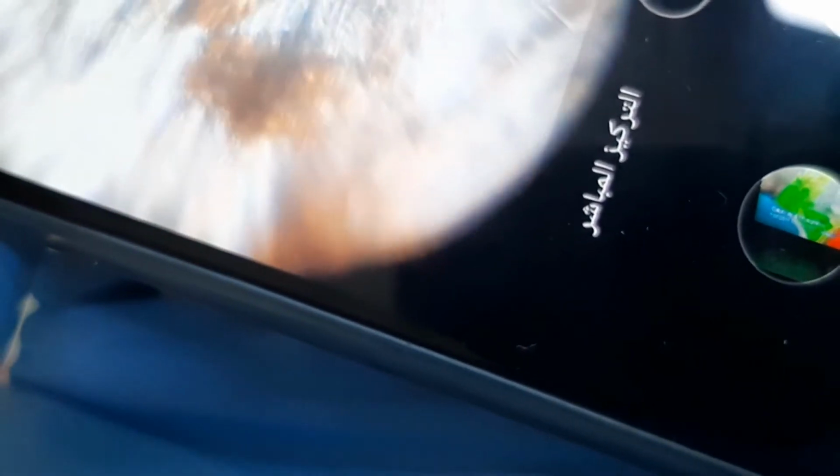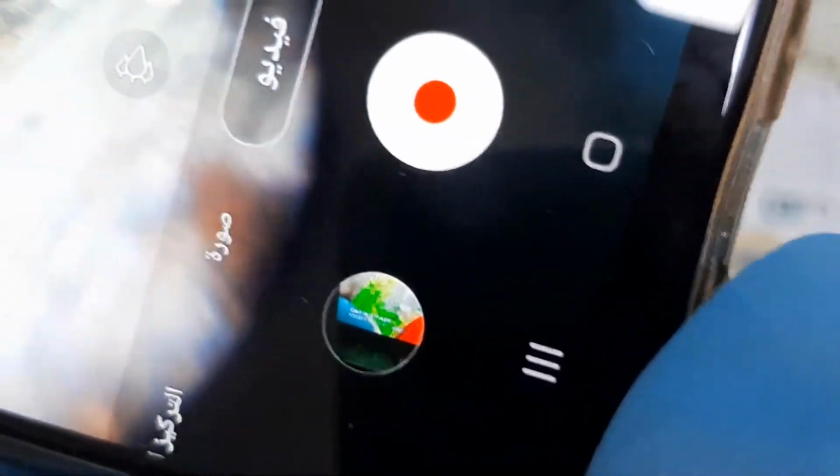I remember when I made this slide, I had to take out the many layers of the wing because it was thick. So I ended up having one thin layer, and I did that by simply putting it between tape and the slide, and then removing the tape, and after that bringing it back.